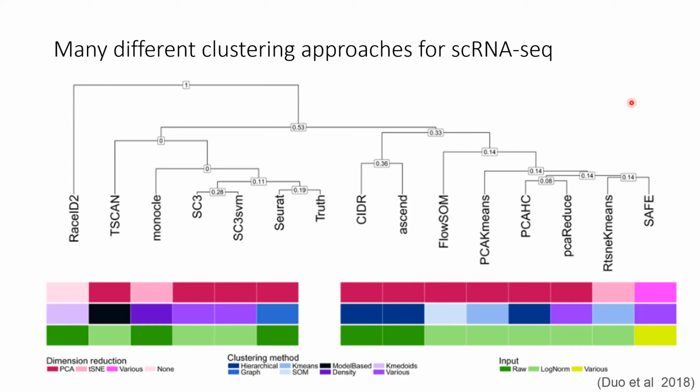Where is ScanPy? Great question. ScanPy replicates Seurat, so we can lump those together.